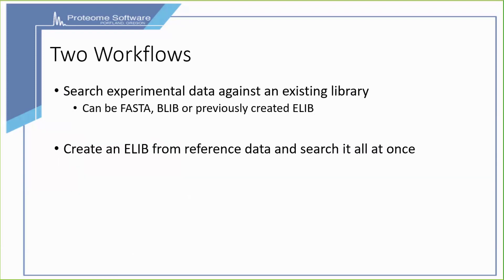Scaffold DIA contains two workflows depending on what type of data you have available. The first workflow allows you to simply search experimental data against an existing library or file. The second workflow allows you to create an ELIB from reference data and search it all at once.